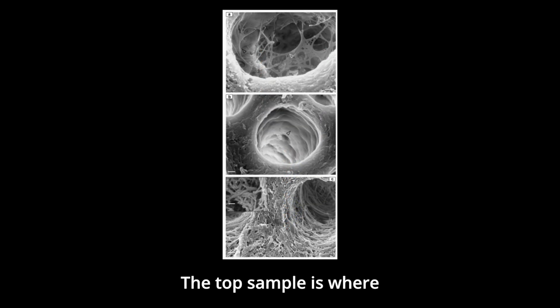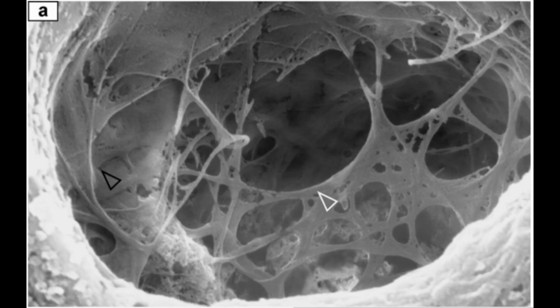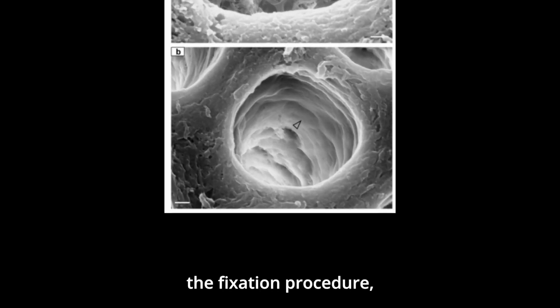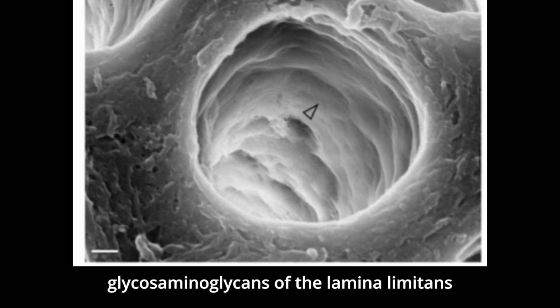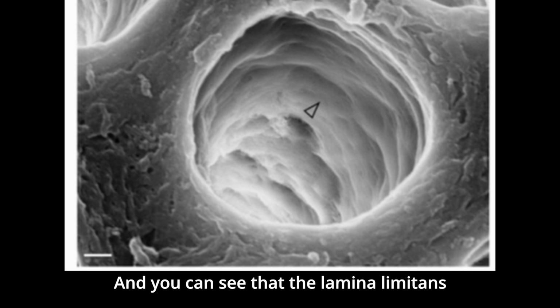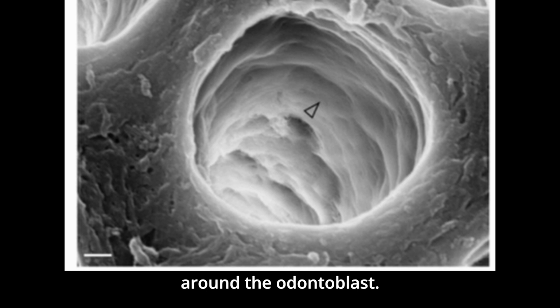So these are 3 samples. The top sample is where the proteoglycan structure of the lamina limitans is actually preserved, and you can see that it is quite a structure. In the middle section, those proteoglycans have been destroyed by the fixation procedure, but the glycosaminoglycans of the lamina limitans are preserved. And you can see that the lamina limitans is really a sheath-like material around the odontoblast.